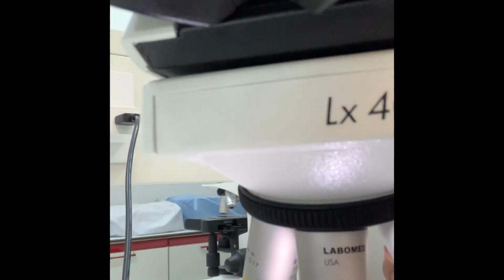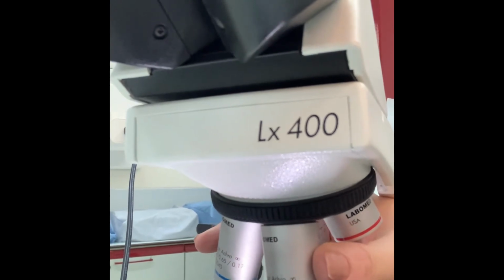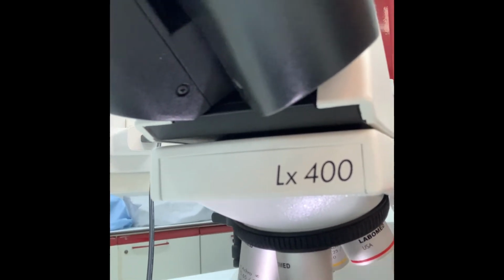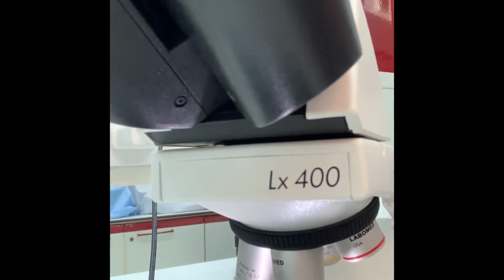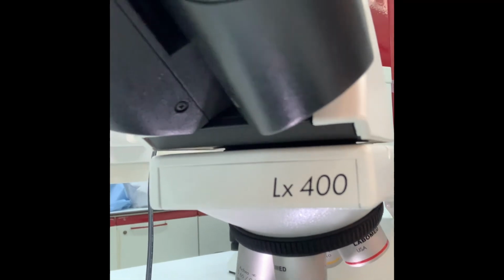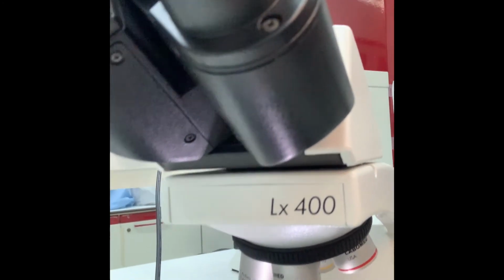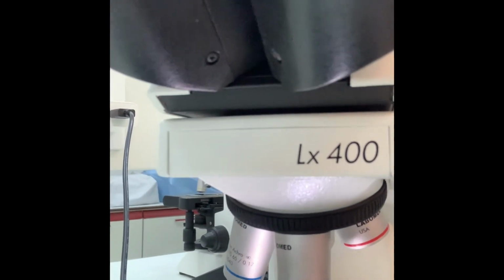It's not touching. But when I go for objective 100, it will touch the slide. See, I won't go any further. I need to add a drop of oil. It is called oil immersion, to avoid breaking the slide because it will cause a friction. So the oil immersion is to facilitate the movement of objective 100.